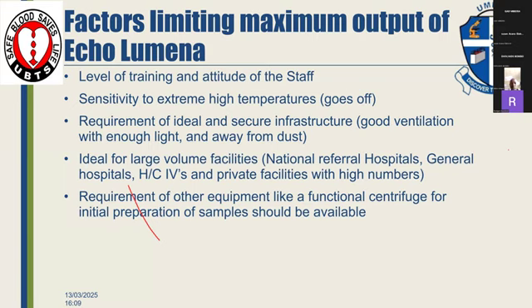Secondly, this machine in some areas where the temperatures are too high, those who have observed towards the end of February, the sunshine has been very hostile. In such temperatures, if it goes beyond 35, the machine tends to go off. We experienced that last year and we got a solution for it.